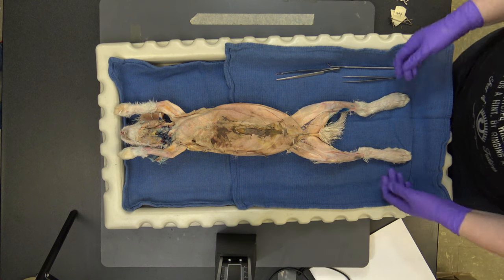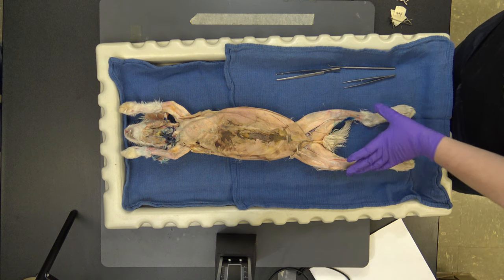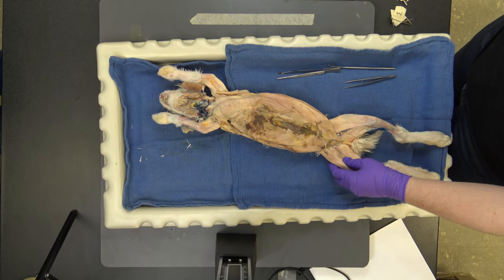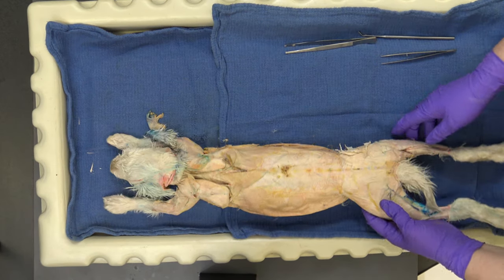Hey, we're back. And the rabbit looks a little bit different. We've gone through and separated out all of the different muscles that you need to know. I'm going to show you really quickly just what that entails before I start going over the muscles.